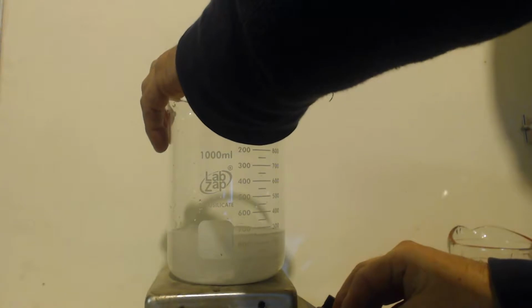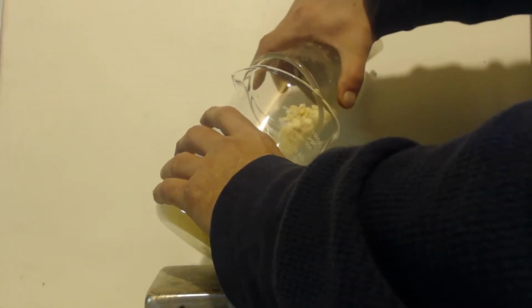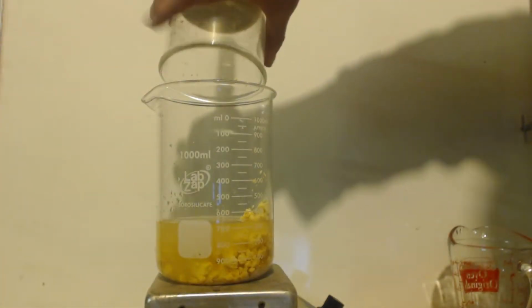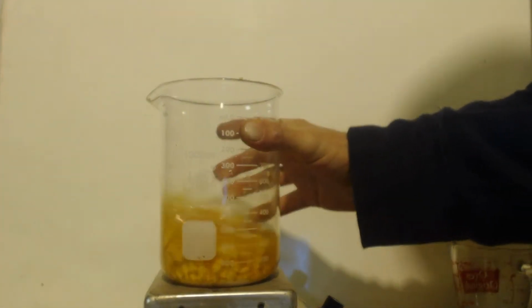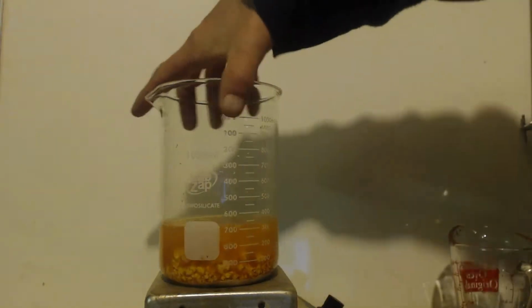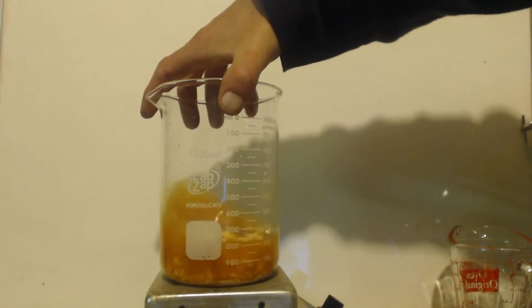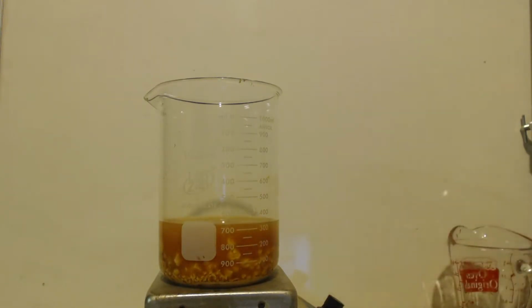because I'm going to toss this in. Oh. All the product I had. Just toss it right in there. Basically, I'm going to try and make the salt of that acid, sodium toluate. It's not letting my stir bar work. I'm just going to stir that up, I guess, by hand here until I get my stir bar to work. Hopefully it'll dissolve. Once it does, I'll be back.